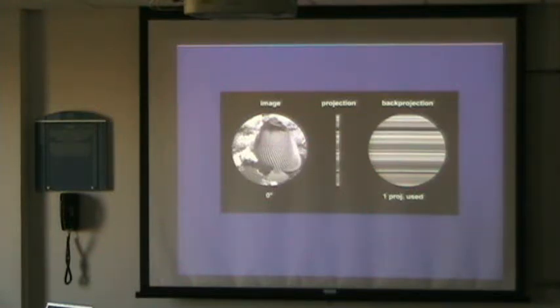We have already one projection in this direction. Now I'm going to show you another projection in this direction. And what I end up with is this here, which is all the densities along a line superimposed into one spot. And then I can back project as long as I want. I'm not going to get my 3D back anymore, right? So I have to get different views. Otherwise, this is not going to go.